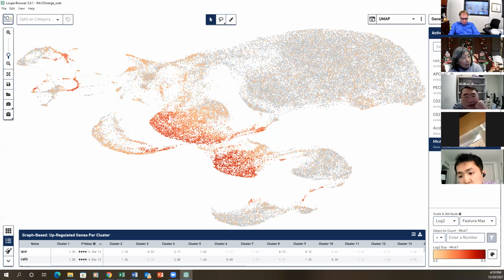Another interesting thing is when I look at the CiteSeq, there's a protein level. I found in all knockout cells the protein level is reduced. How do you know the protein level, Sharon?